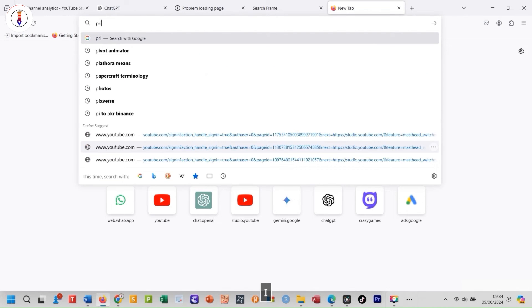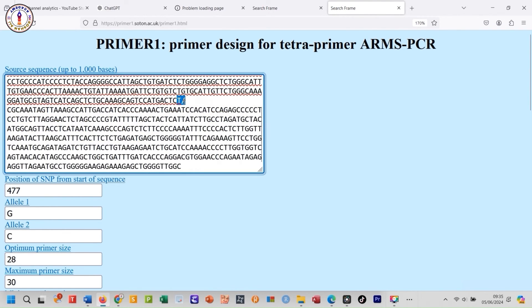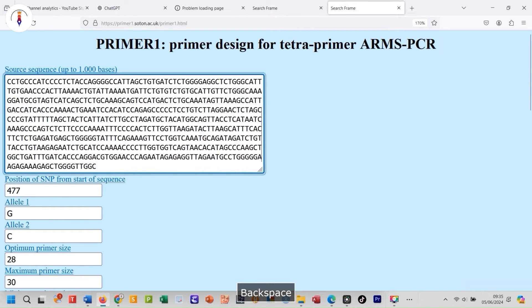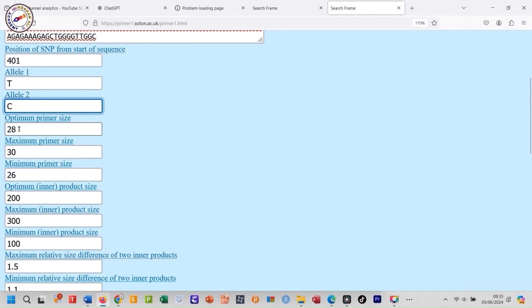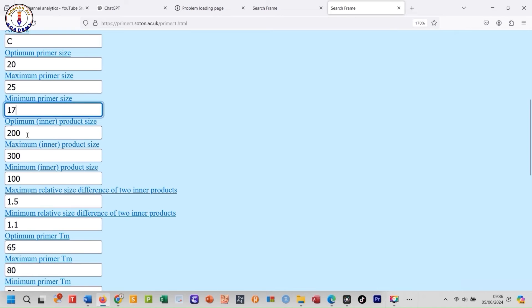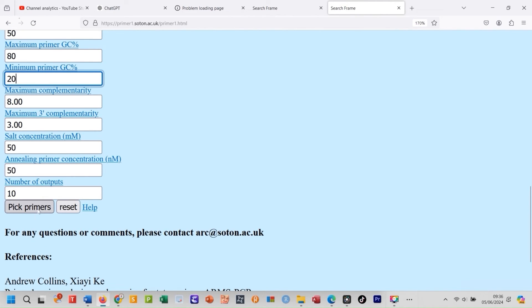Now copy the whole sequence and go to the Primer1 site. Paste your sequence into the input field. You will need to delete one of the alleles from the SNP position — we only need one here — and remove the slash as well. Type the position of the SNP, then type the SNP of allele 1 and allele 2 in the respective fields. You can change the primer size; I would change the optimum length to 20 and the minimum to 17. You can also change the inner product sizes, primer melting temperature, GC content, etc. I would leave most of them at default values. Now click the submit button.